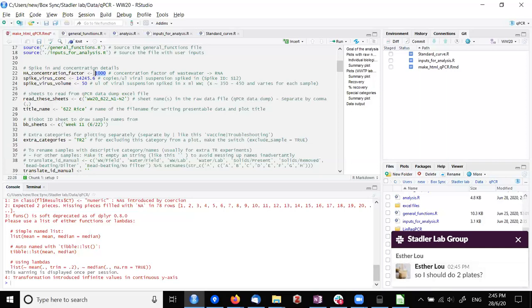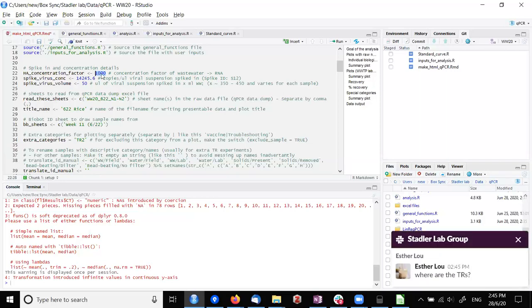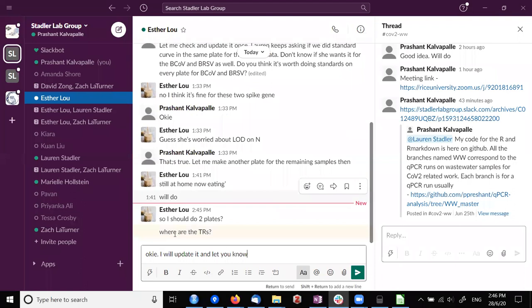And so I think there'll be a factor of, like, 10% or something might increase compared to this factor. Yeah, something like that. It'll be different for the QI than it will be for this week, I mean, in the previous weeks.